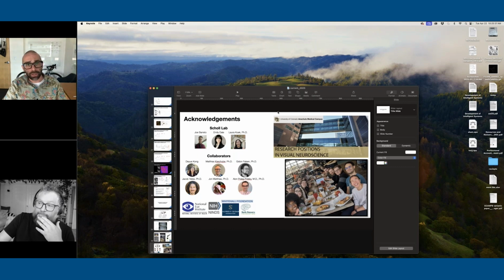And the larger the pore, the more you start to see these things, the more sensitive the cells. You also see that these are not native channels to the cells, and the bigger the pore, the more ions and the bigger ions it lets in, the less happy the cell is. So you can have more phototoxicity, and the cells can have a shorter window of happiness. We're also using Chrimson. That does work pretty well. But with some of the mutated variants that have much bigger pores, in our hands, we usually see that a lot of the cells are dead or just super unhappy. So finding that sweet spot in your biological prep is really key.